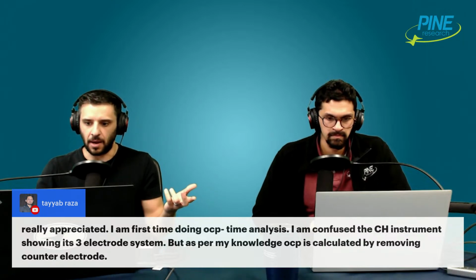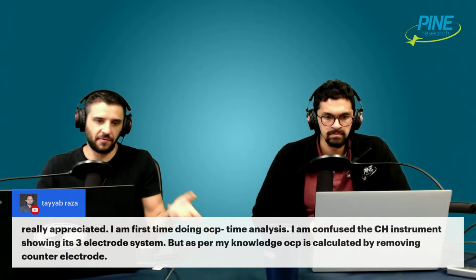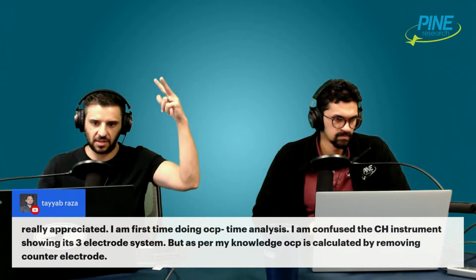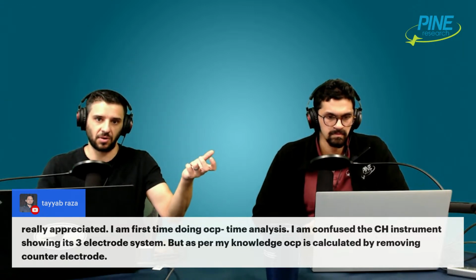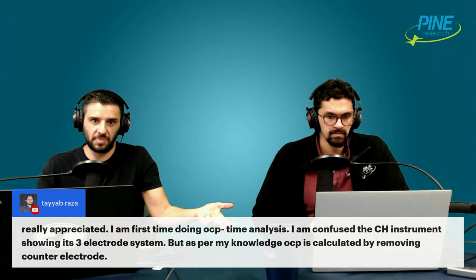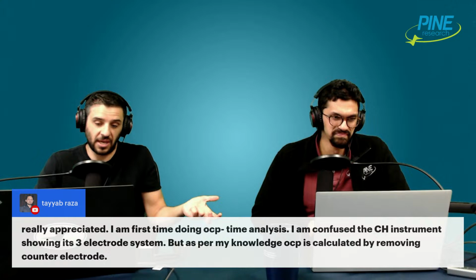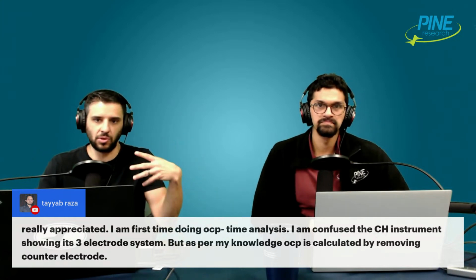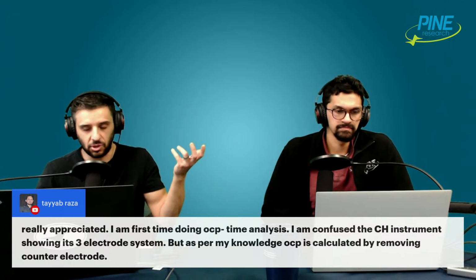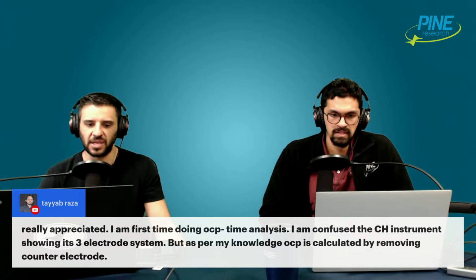So the removing of the counter electrode is something that happens with the instrument itself, but that doesn't mean you have to physically disconnect the counter electrode. You could probably disconnect the counter electrode and measure OCP and see what happens. It should be the same. If it isn't, I don't know what the heck your potentiostat's doing. But effectively that is what's happening. You don't need to disconnect the counter electrode. You shouldn't have to anyway. It should happen automatically. So that is fundamentally what is occurring, I believe.